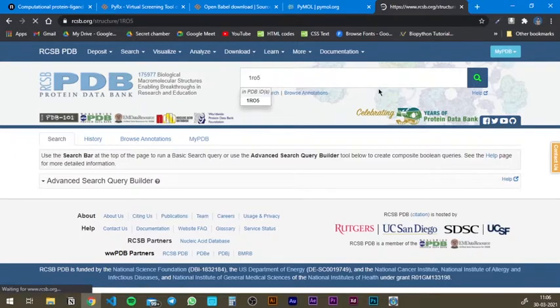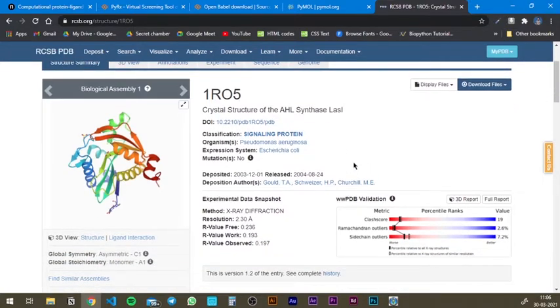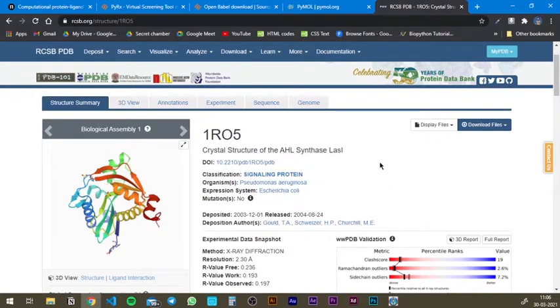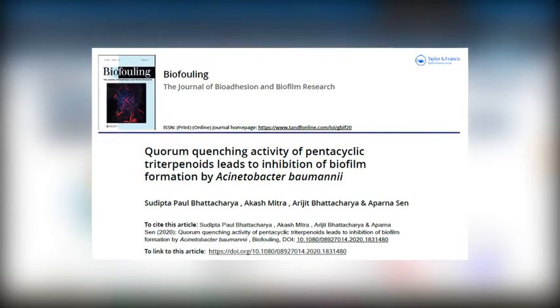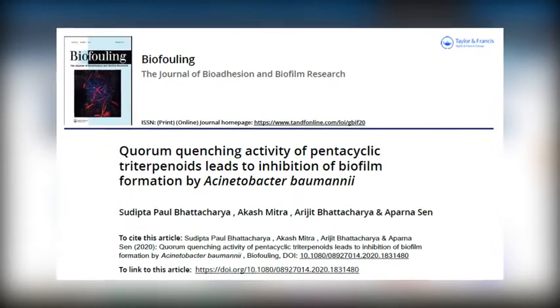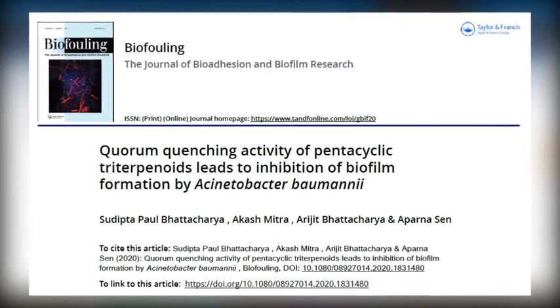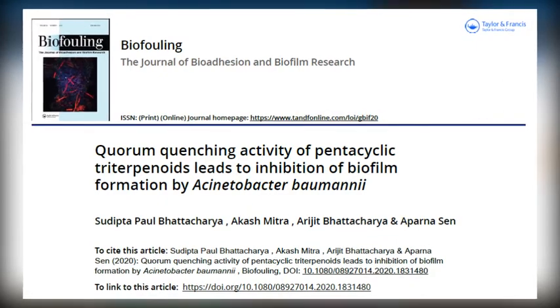I'm going to select 1RO5. This protein is responsible for quorum sensing in Pseudomonas aeruginosa — it's a bacterial protein, and the name of the protein is Acyl-Homoserine-Lactone Synthase. There was a paper released a couple of months back that I was a part of, and we worked on quorum sensing in Pseudomonas aeruginosa and Acinetobacter. This is one of the proteins we worked on, looking at protein-ligand docking with 1RO5.